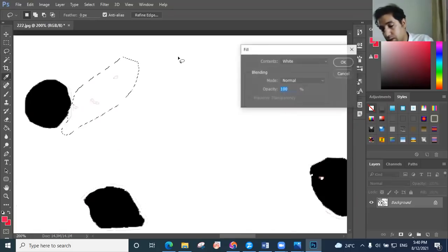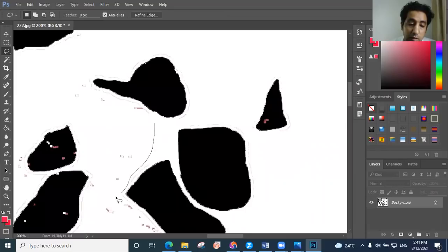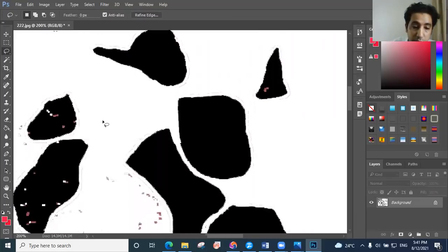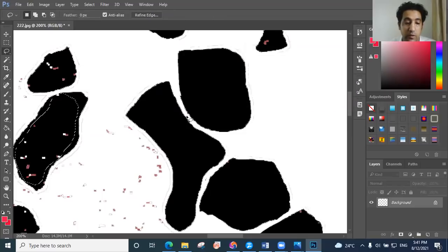Just be patient. This work is a little boring, but it has a good result. You will be happy if you do this, and then maybe you will face these problems, so they must be solved.